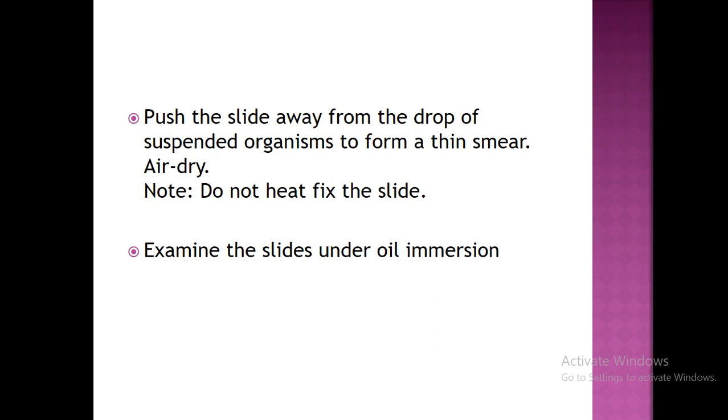This smear should be thin and then the slide should be air dried. Remember, in this negative staining technique, the cell is not heat fixed. In simple staining and gram staining, we first heat fix the cells and then place a drop of stain.